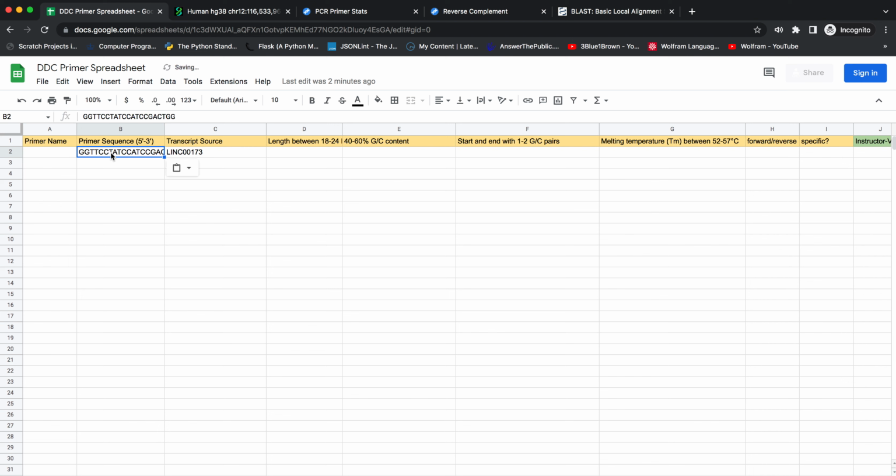So we have our primer sequence. We've checked all of these various components, and we know that they're all the way they're supposed to be. And we can also say that this is a forward primer, because it's the starting point of our insert. And we'll just give it a random name here, test 1. You'll want to make the test name something that you can write down easily on a test tube.